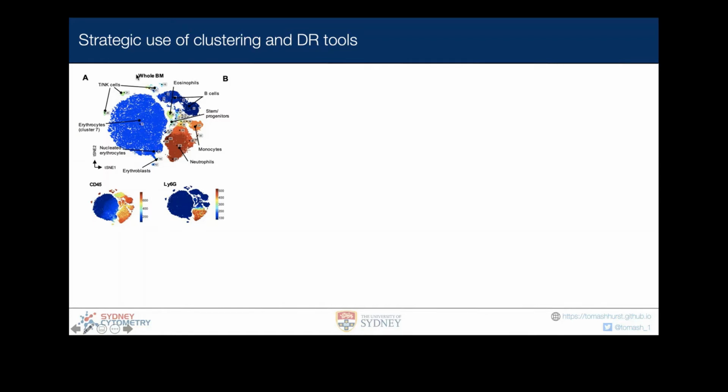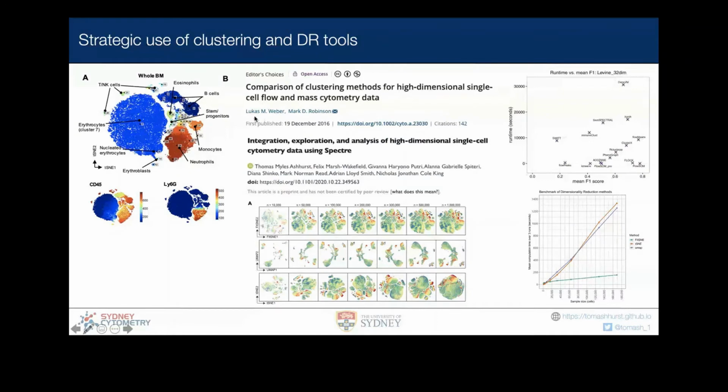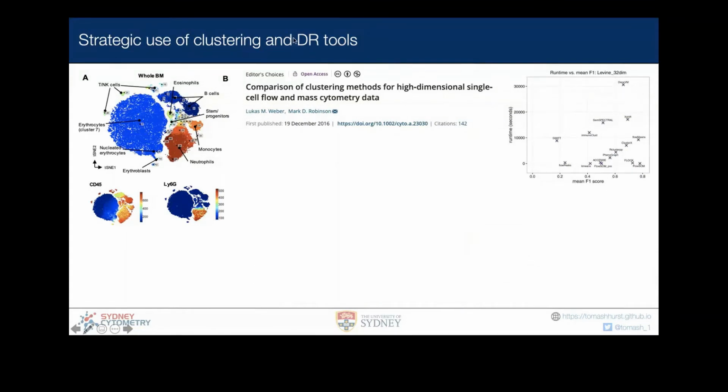Now, one thing that we have to do in this space is be a bit strategic about how we utilize these tools. From a number of papers around the place, including one of our own, this first one here was a great example by Lucas Weber, where you can look at how accurate an algorithm is versus how long it takes to run. These are both important things. You could make an argument that accuracy is the thing that matters in the end, but being able to run things quickly so that you can see the result, assess it, decide if you need to make a change, run it again, run a few versions and see how they compare, is really important to the way that we do this kind of work.